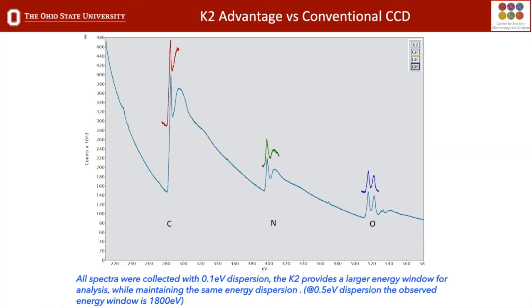So what this means is for samples like strontium titanate, strontium's characteristic edge, the L23 edge, is going to be out at like 1900 eV. So now we have oxygen here at 500, titanium would be around 480. We could put from 400 all the way out to 2200 on the spectrometer and be able to see strontium, titanium, and oxygen simultaneously while also mapping.